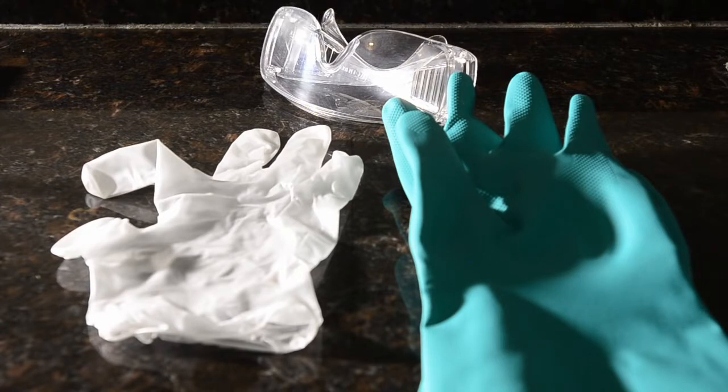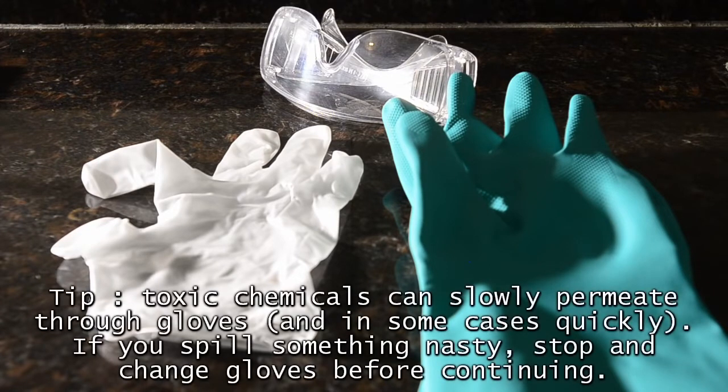Remember that gloves aren't a permanent barrier. If you get something toxic on them, then stop, take them off, and replace them.